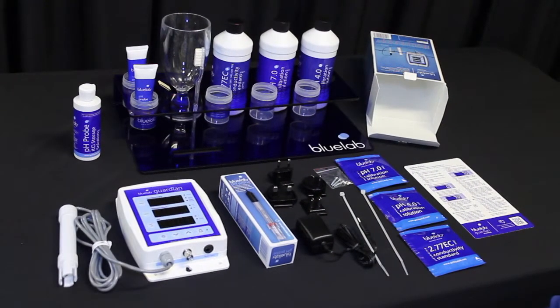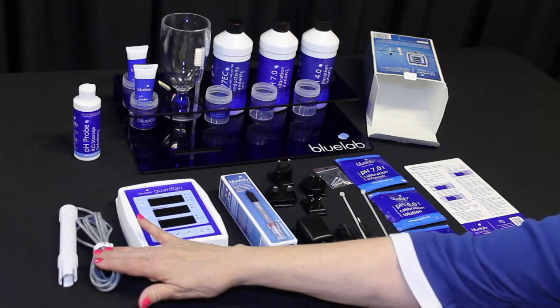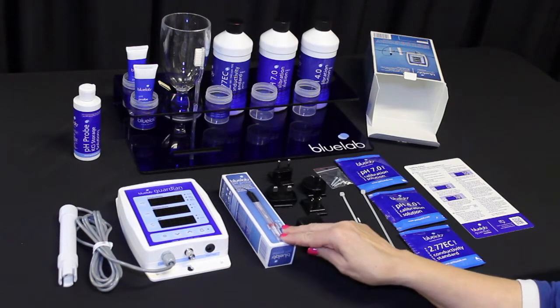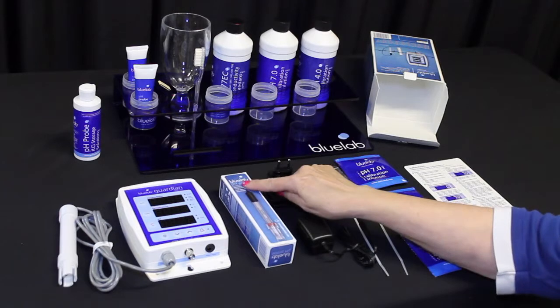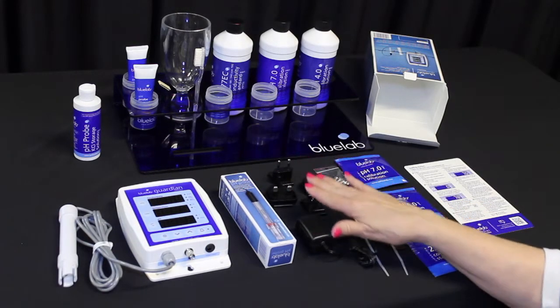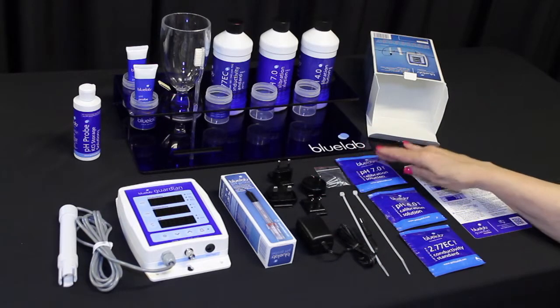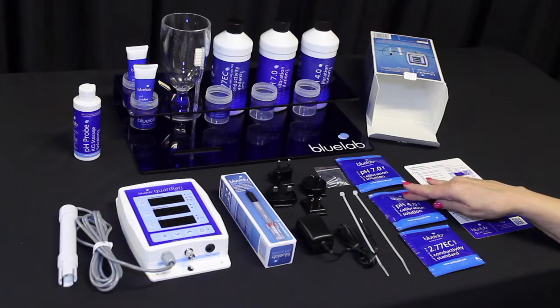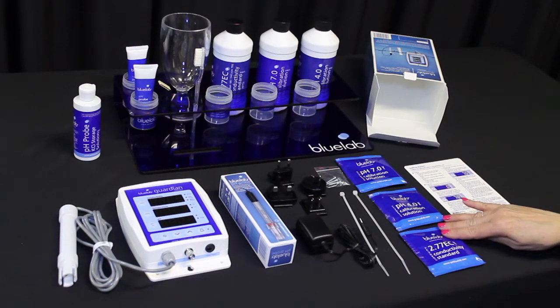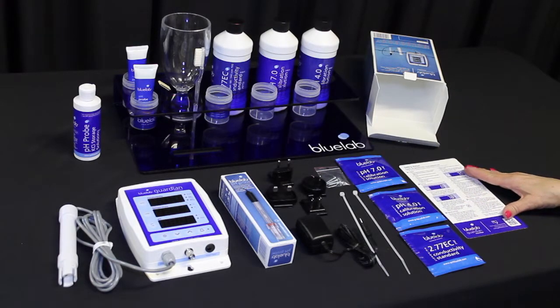First, check the box contents. The Bluelab Guardian Monitor comes with a conductivity temperature probe attached to the monitor. You'll also have a replaceable Bluelab pH probe, a pH probe holder with suction cup, a 5 volt power supply, plug adapters, four mounting fasteners, two cable ties, pH 7.0, pH 4.0, and 2.77 EC single-use solution sachets, plus a getting started guide.